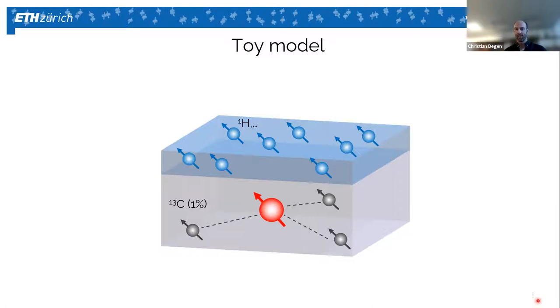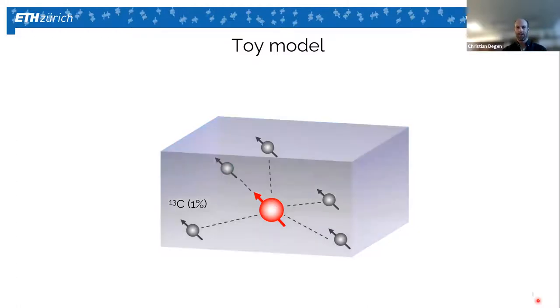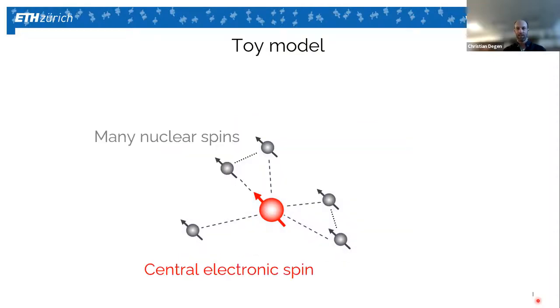We can at times detect spins on the surface. Those mostly are films. So we detect a bulk type NMR signal from protons or also fluorine of a molecular layer at the surface. So again, moving on, what I'm mostly going to focus on today, except for the last few slides, in an outlook, are the C13 spins. And if you take this picture and make it even more general, what we're trying to do now in the following is take a central single electron spin and see whether we can detect single nuclear spins. So first one of them and then several of them, and ultimately also whether we can detect couplings between them.